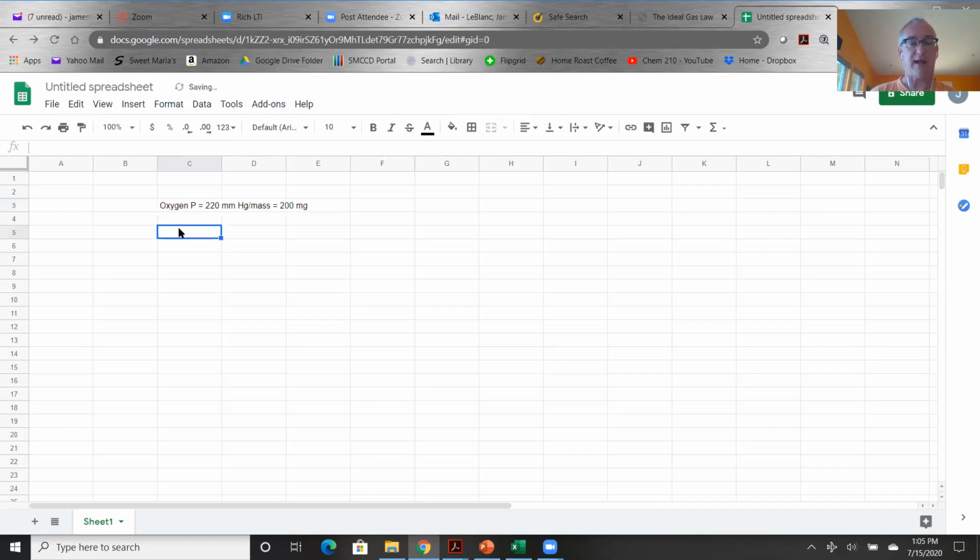So what data did we collect? We collected temperature and we collected volume, right? And the temperature was in degrees C, and our volume was in liters. So that's fine. So I just type in my degrees C.